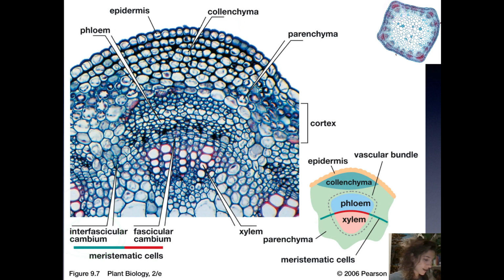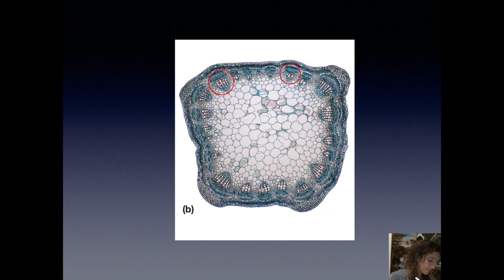And we can see that by doing this. Right on the outside of the xylem and the inside of the phloem, continuously through that interfascicular region and then into the next vascular bundle, we get this continuous line of vascular cambium all the way around. This is what is so important, the fact that the vascular bundles make a full ring.